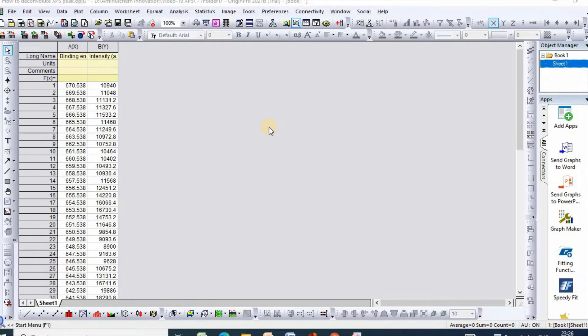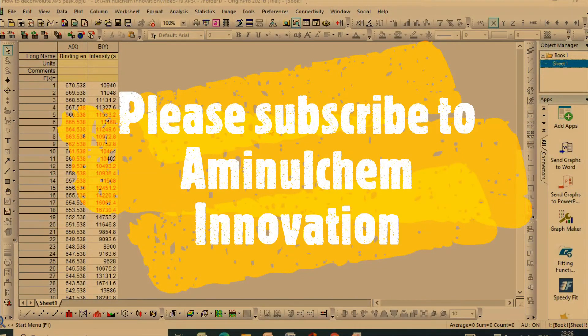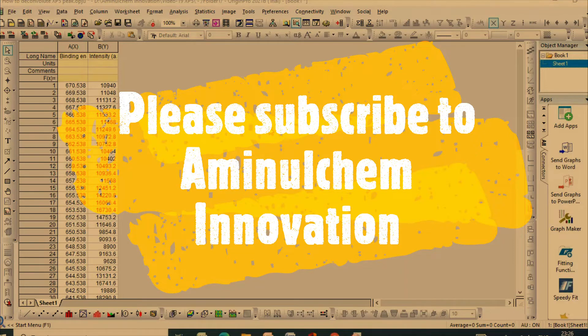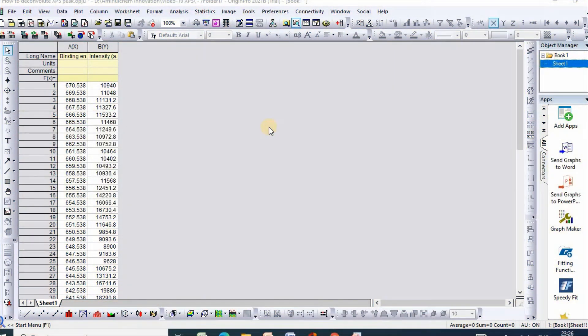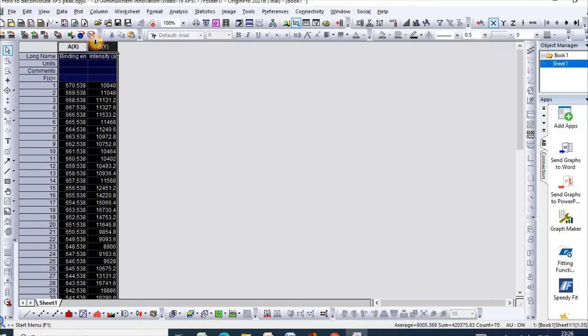Deconvolution is usually performed for identifying oxidation states and different bonding patterns for a sample, and it is easily done by multiple peak fit. I have taken data for binding energy and intensity for a pyridocyte sample.